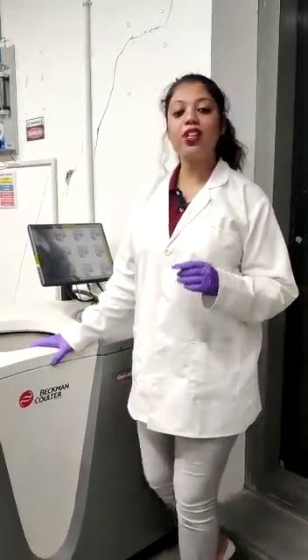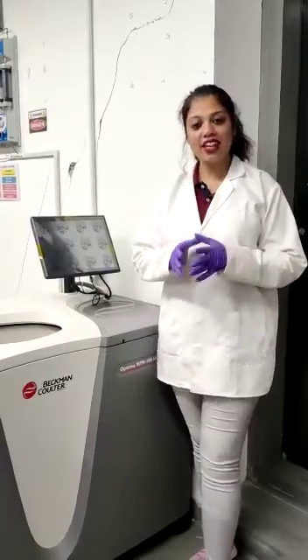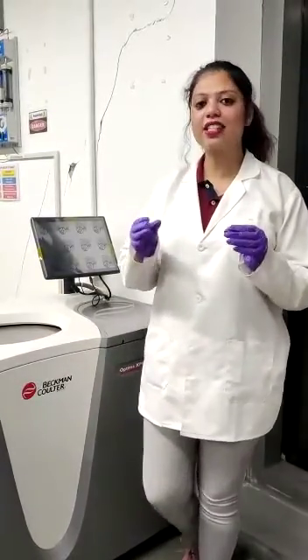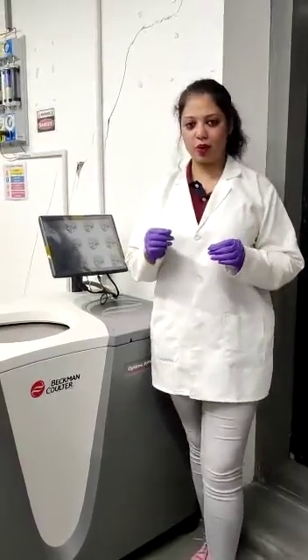Like any other centrifuge, an ultracentrifuge also works on the same principle — it creates an artificial gravity as a centrifugal force that separates the denser molecules from the lighter ones.